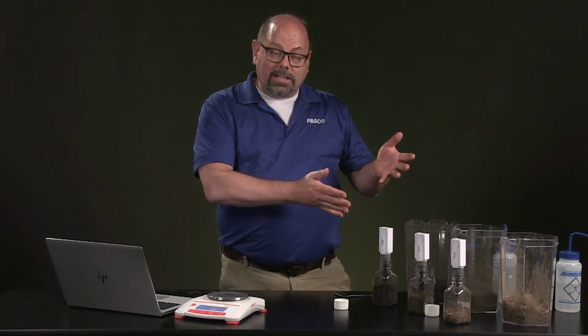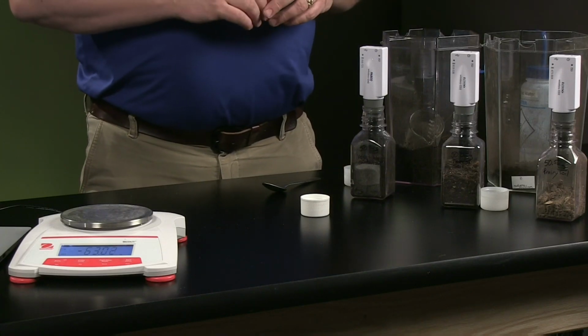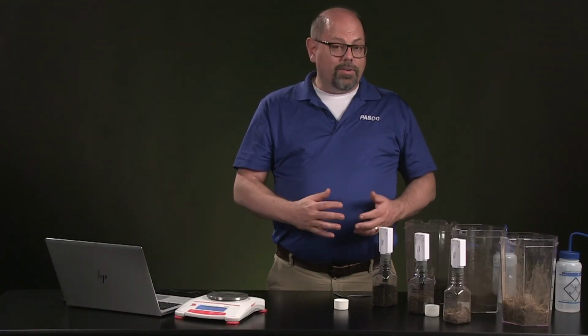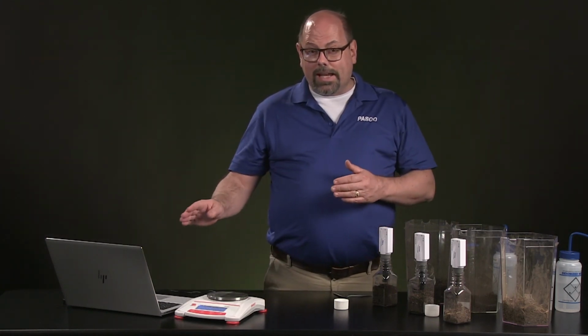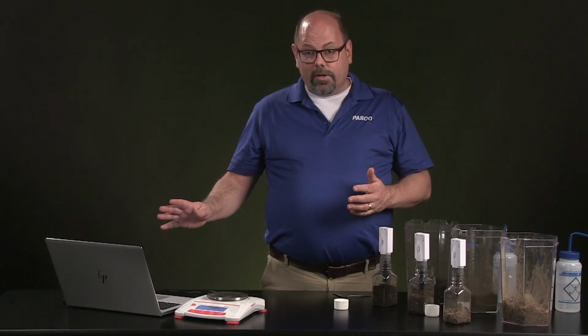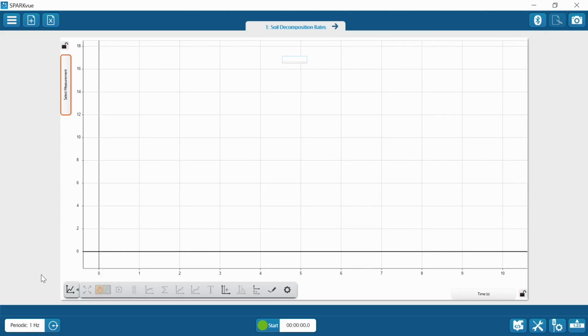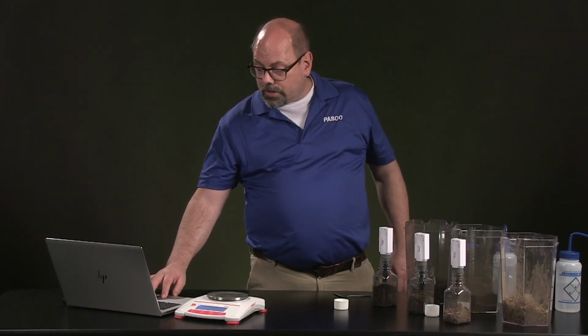All right, now that we've got all our soils collected, we've got our CO2 sensors in the soil samples. There should be some decomposition possibly going on. Again, we've taken them right from outside. They're fairly dry. What we want to do, though, is help you to set up the graph. And like I said, I just started SparkView right from the beginning and said, let's build a new experiment. The first axes, the X and Y axes here, the X axis is going to be the time. We're going to see how CO2 develops over time.